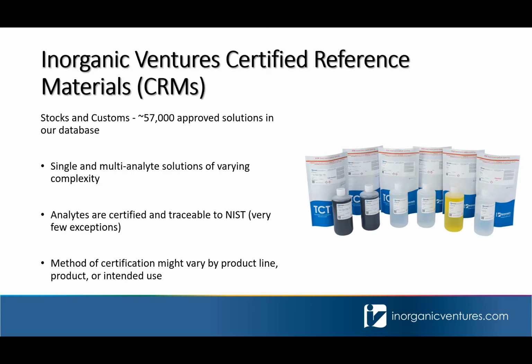Our standards are NIST traceable and are provided with a C of A, and the C of A will give you the certified value as well as the associated uncertainty. The certification method used will vary based on the product and or the intended use. So for example, a titrant is not certified in the same manner that a stock ICP standard is certified.